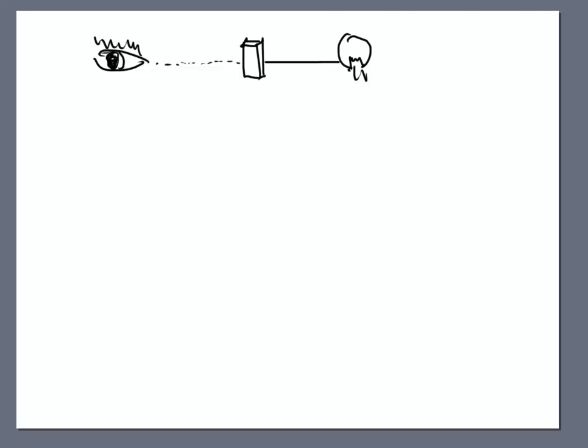Okay, so now we need to really slow down and take a look at what's really going on. We know that these samples have favorites as far as wavelength goes, and I want to dial in on the favorite first. When I dial in on the favorite, what is happening inside of the sample? What's going on as far as its interaction with the light itself? And this light could be UV or it could be the visible portion, right? We just simply don't know until we find out what the lambda max is.